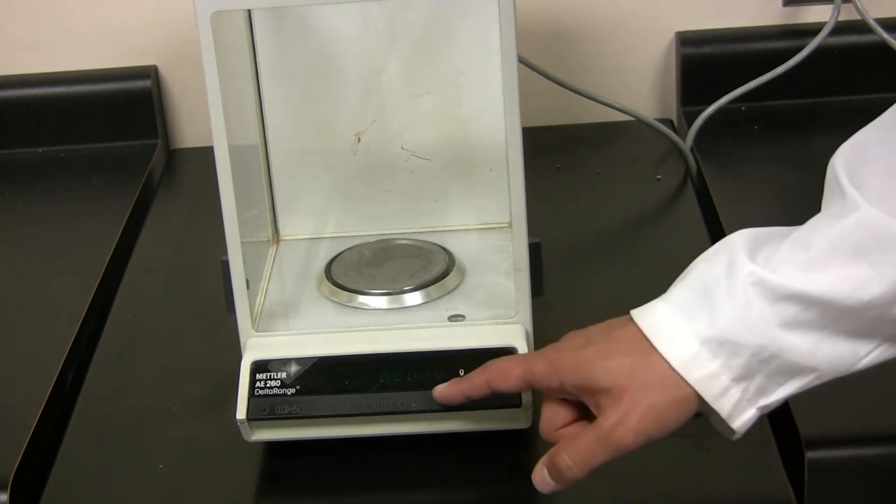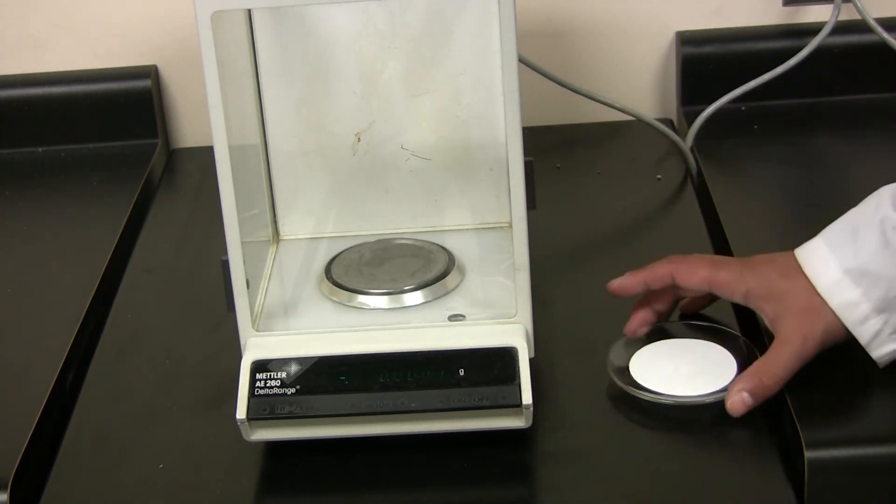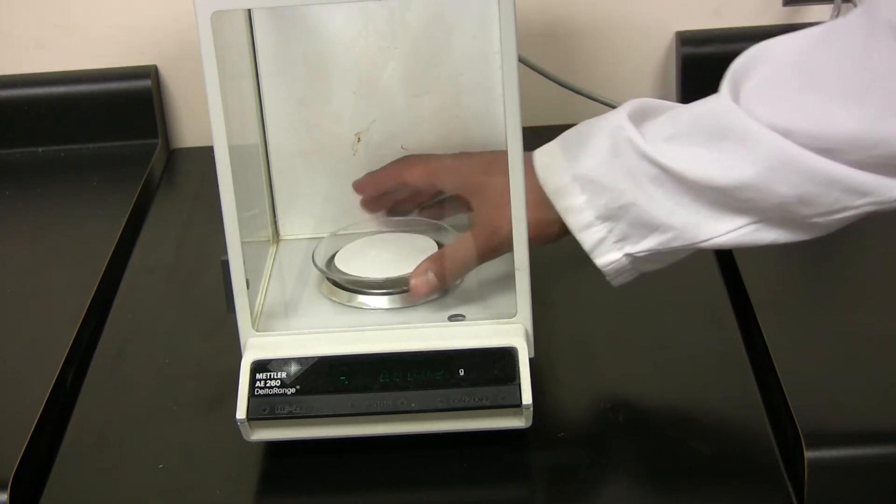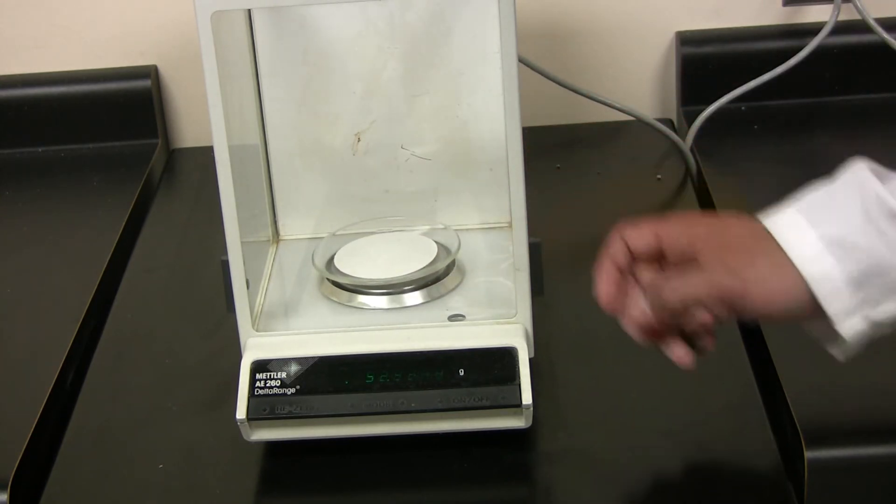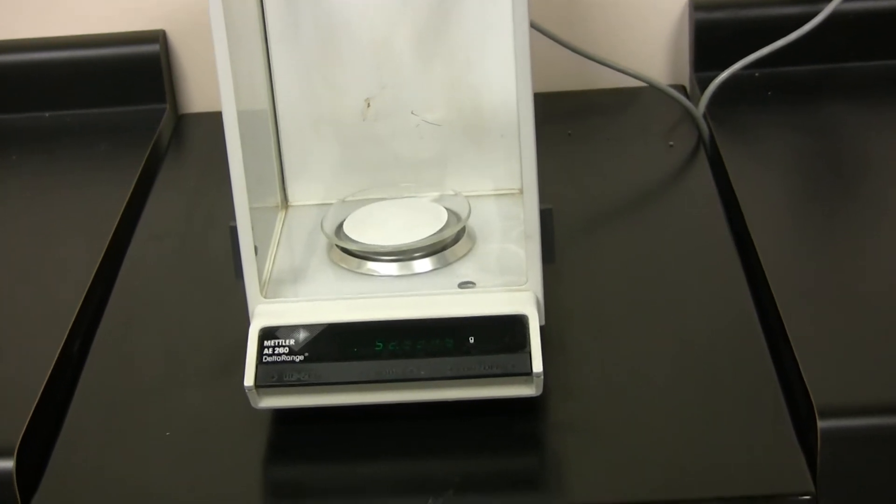Start off by taring the analytical balance. Next, place the watch glass and filter paper embedded with crystals. Subtract this from the empty filter paper to get the total weight of crystals.